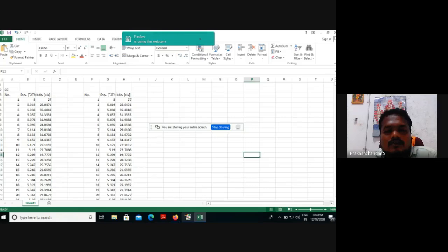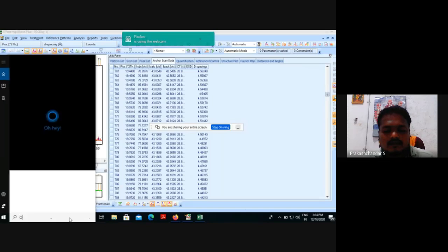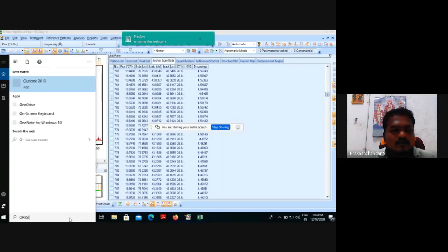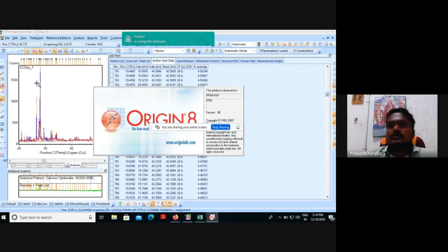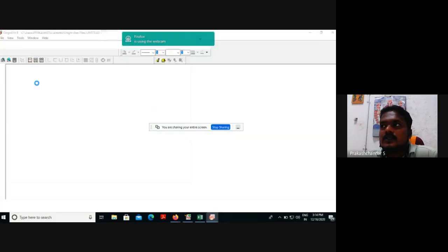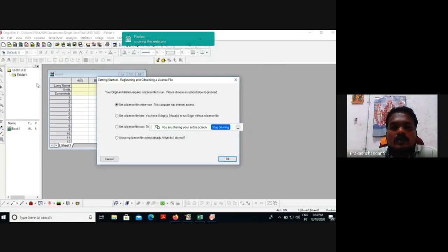Okay, now the XRD Plus work is over. Then go to Origin 8 software. This is the Origin 8 software you are using.